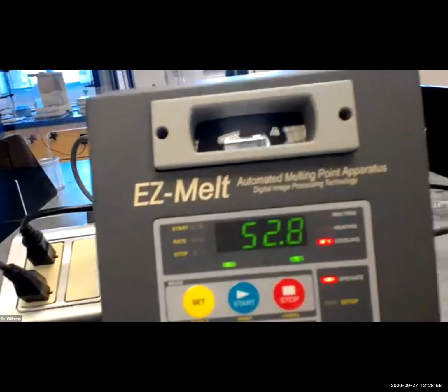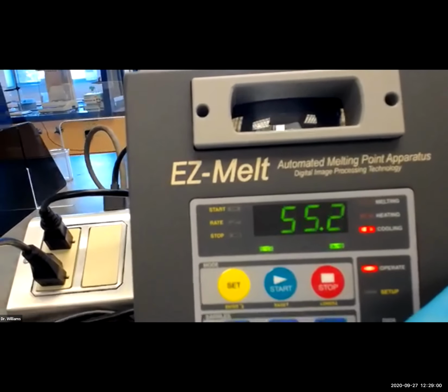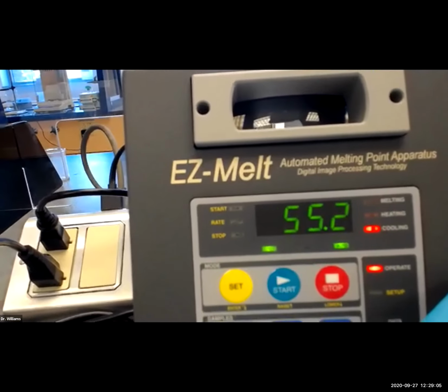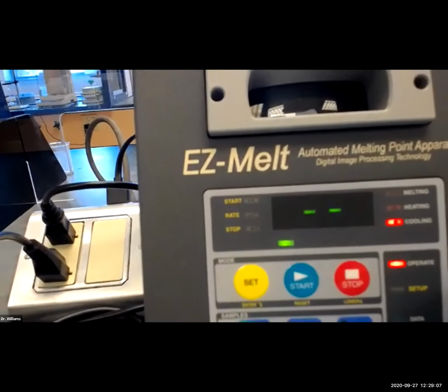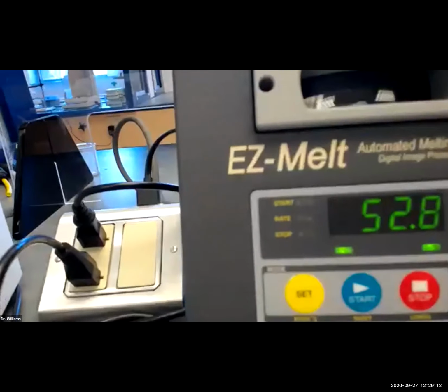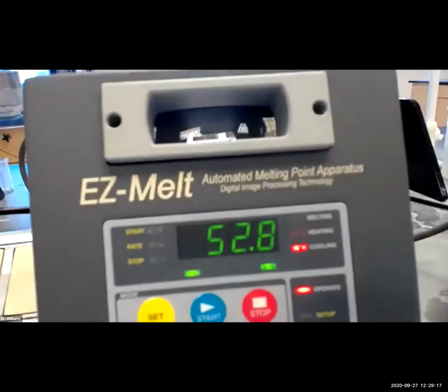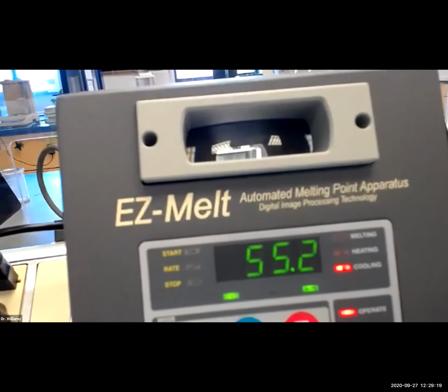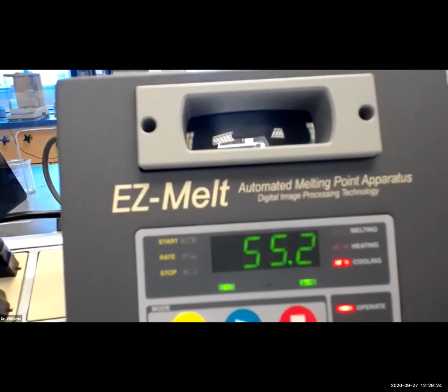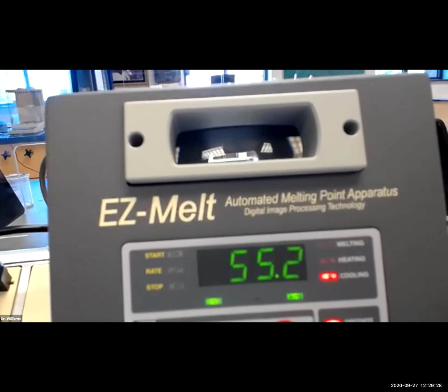52.8 must be the start temperature of where it melted. 55.2 is where it stopped melting. So press it again. 52.8, so it gives you the melting point range. It's 52.8 to 55.2. So if you subtract the 2, that gives you the number of degrees in terms of the melting point range. So this is what you report, that melting point range.